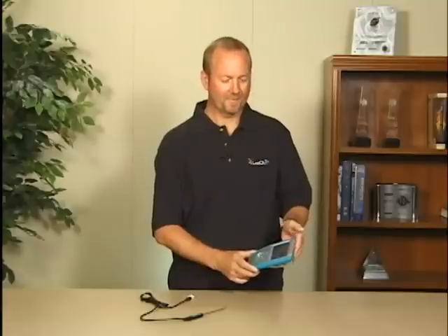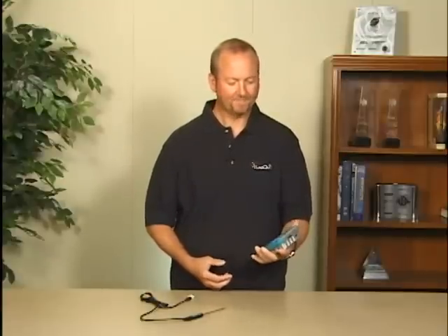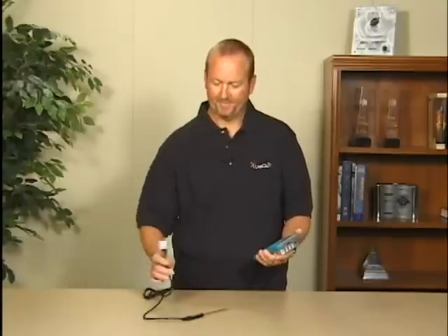Let's get started taking some data. We have a charged unit here, so what we're going to do is turn it on — just push the power button right there and the screen comes on. Notice there are a lot of ports on here; these are all detailed in your quick start guide.